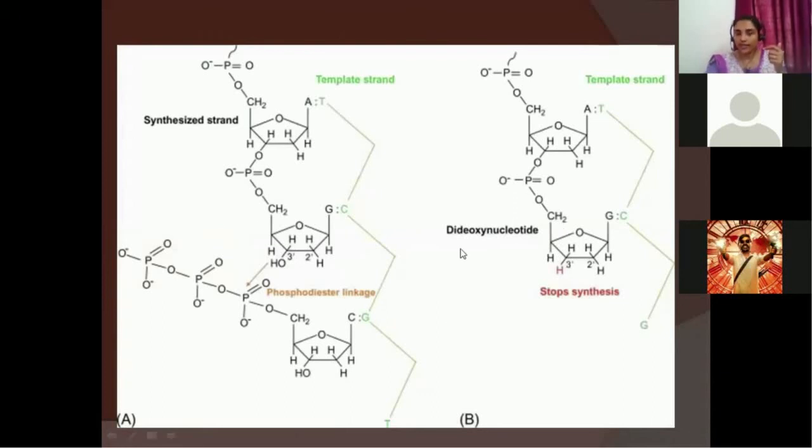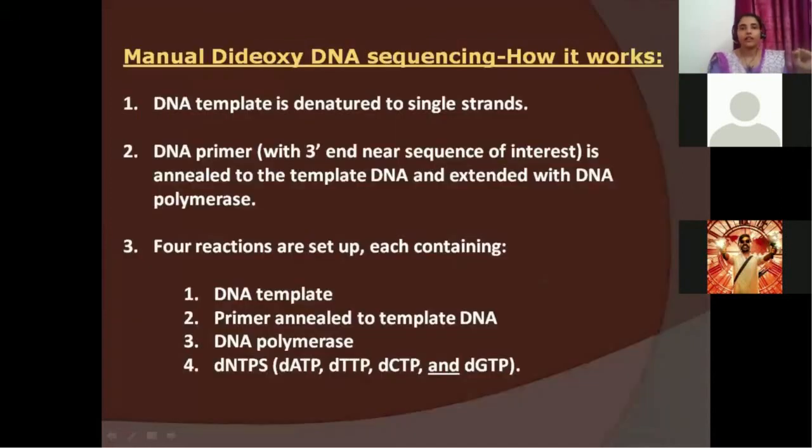So I hope you understand why dideoxynucleotide is being used here. We are learning about the manual dideoxy method, right? As I told you, now we are going to see step by step what we are doing.